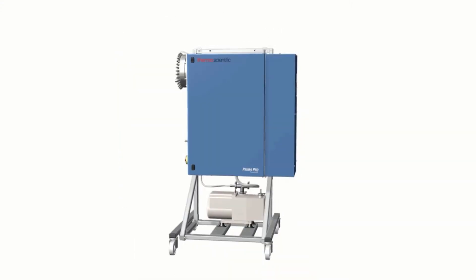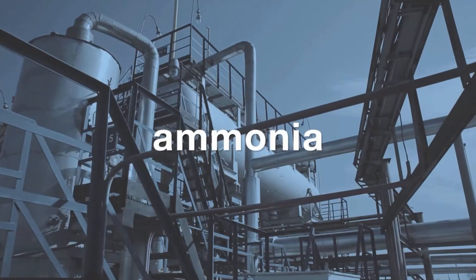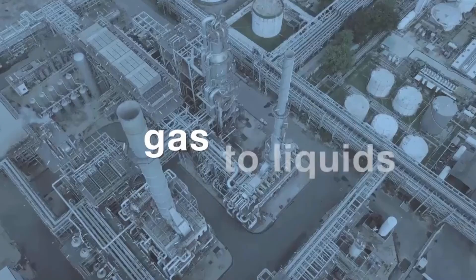Engineered for ease of use and with minimal maintenance requirements, the PrimaPro protects the environment, maximizes product yield, and increases profits in a number of challenging process applications.